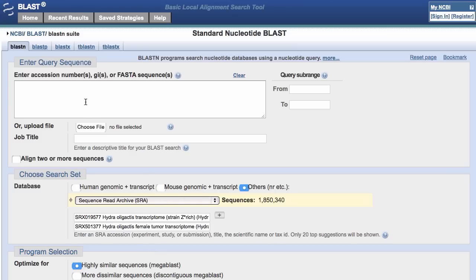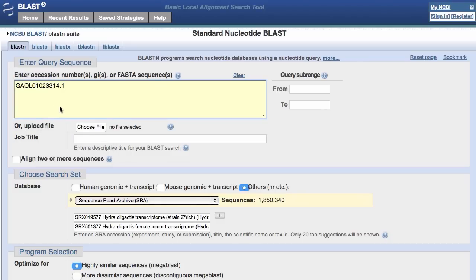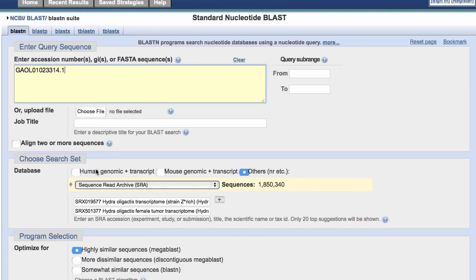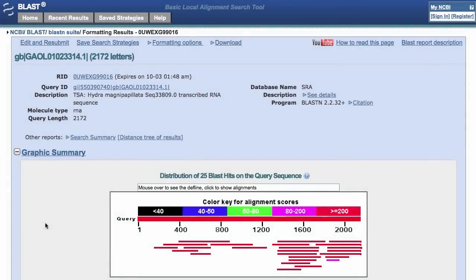I'll put in the same query I had before — pasting in that accession from the TSA — and scroll down and hit BLAST. I get some results, but rather than look at those, I'd like to move on to looking at some human data.